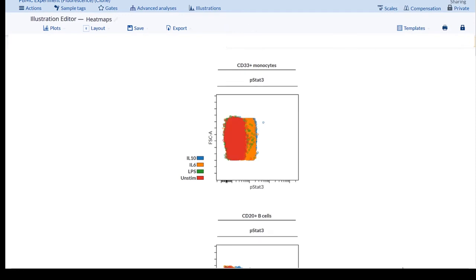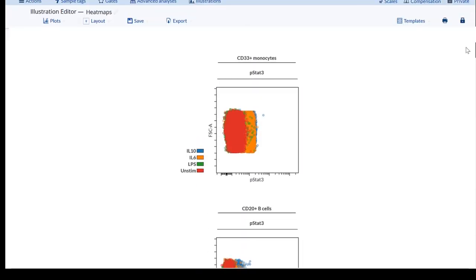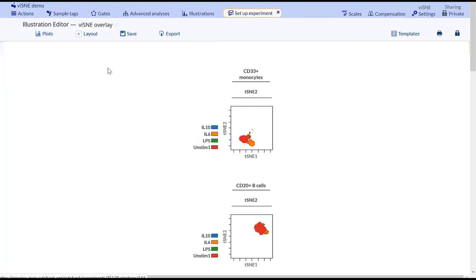Ordering is especially important when visualizing populations that hierarchically overlap. In these cases, the populations with fewer events need to be placed in the stack at a later point.